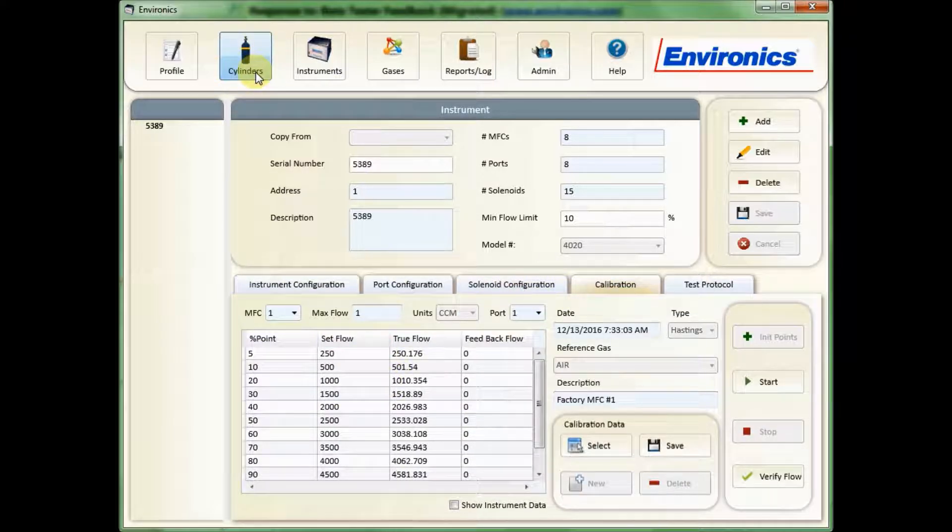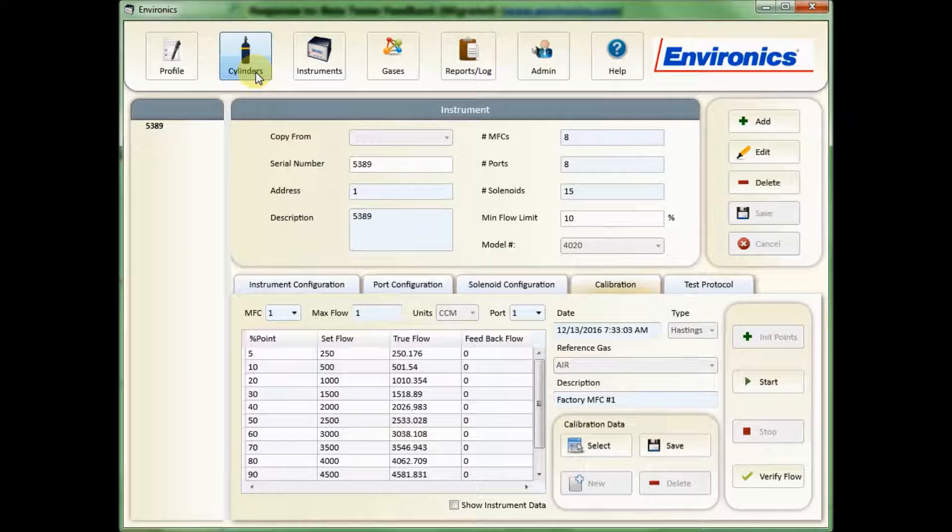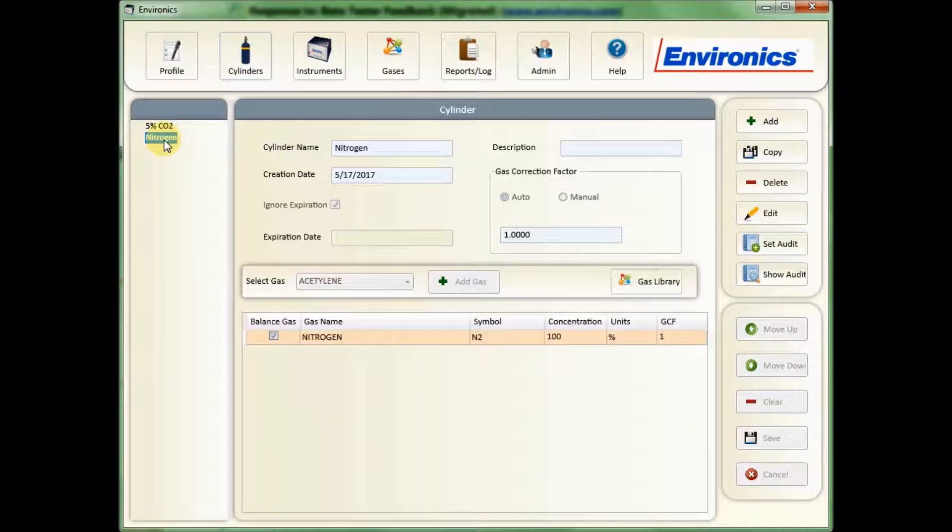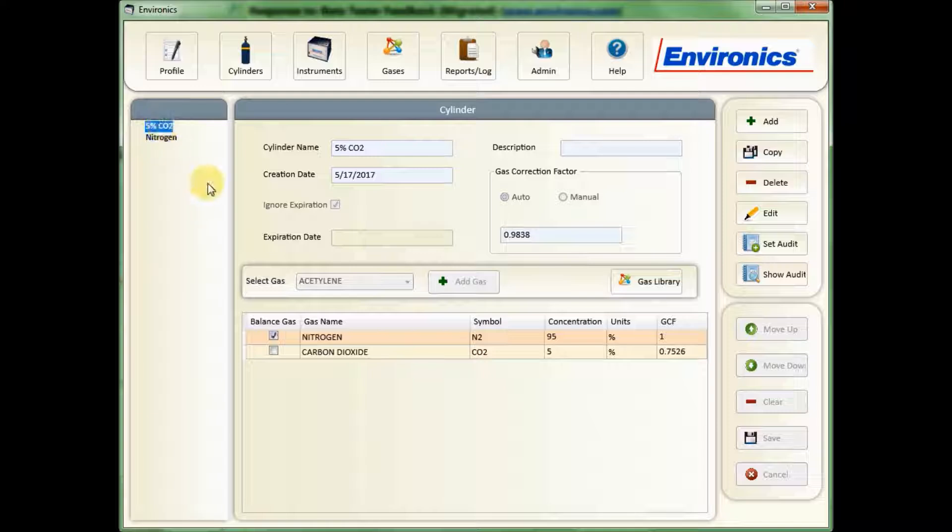The second is to create cylinders, and we've done that as well. Here I have two cylinders, a nitrogen cylinder, and a 5% CO2 cylinder.